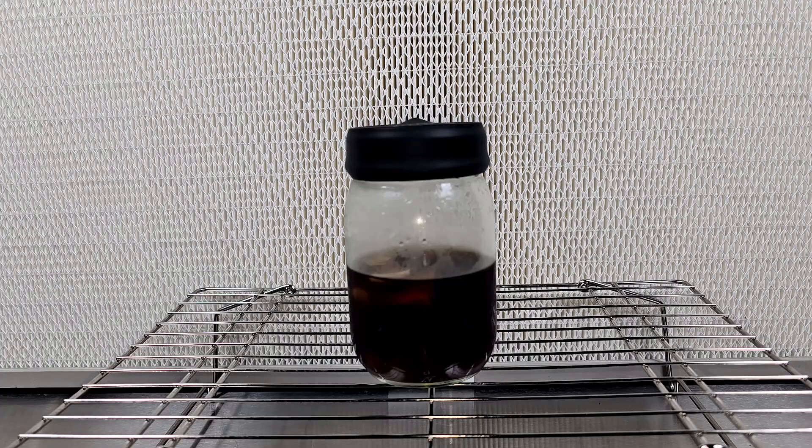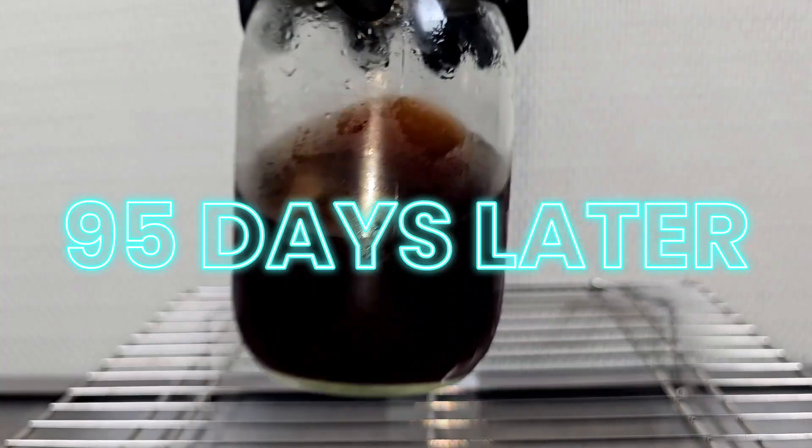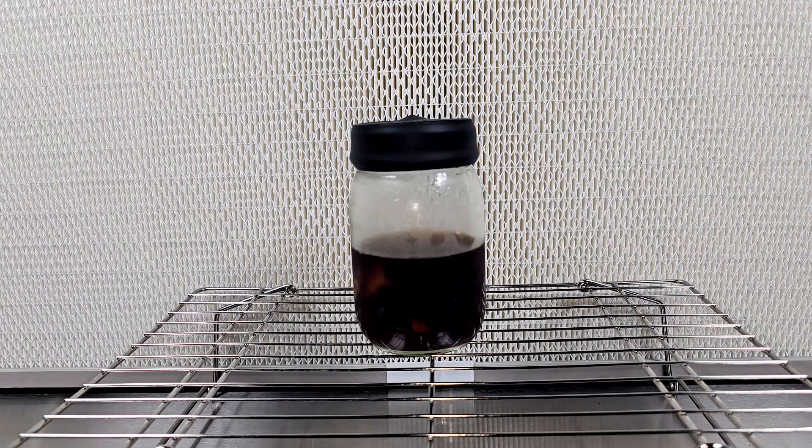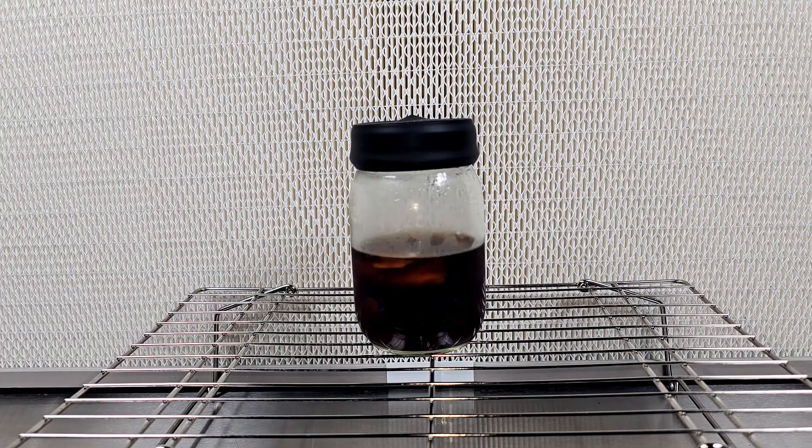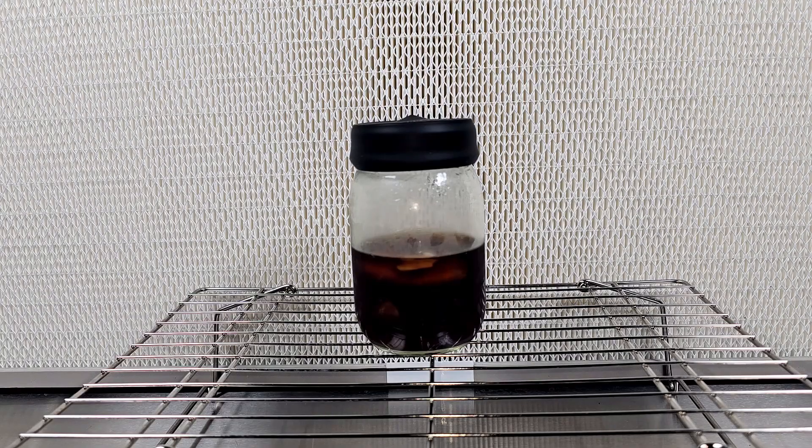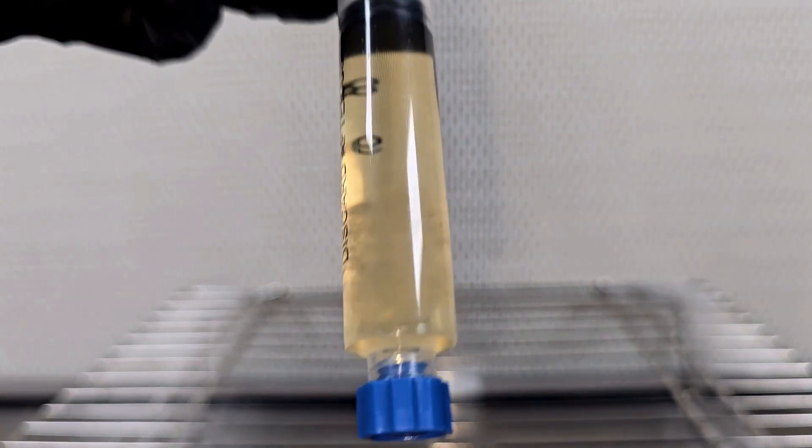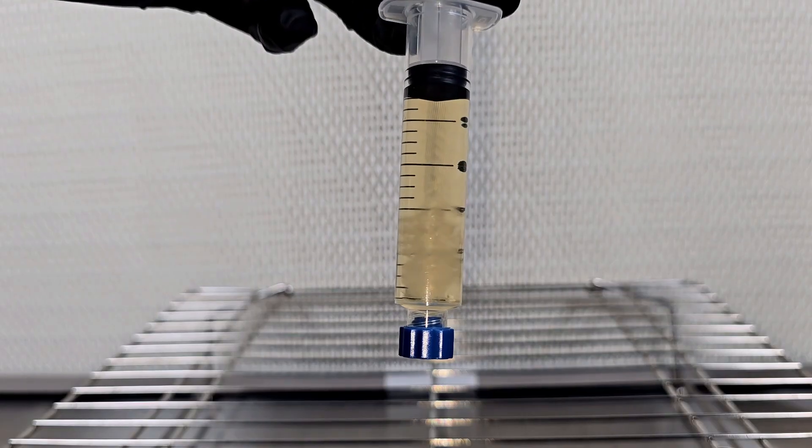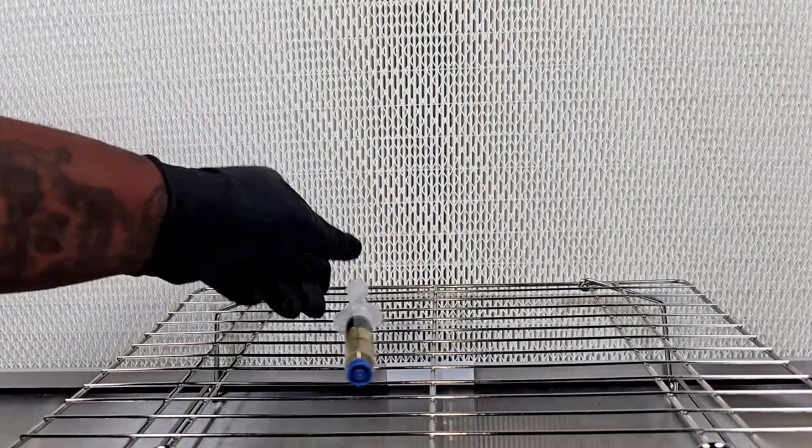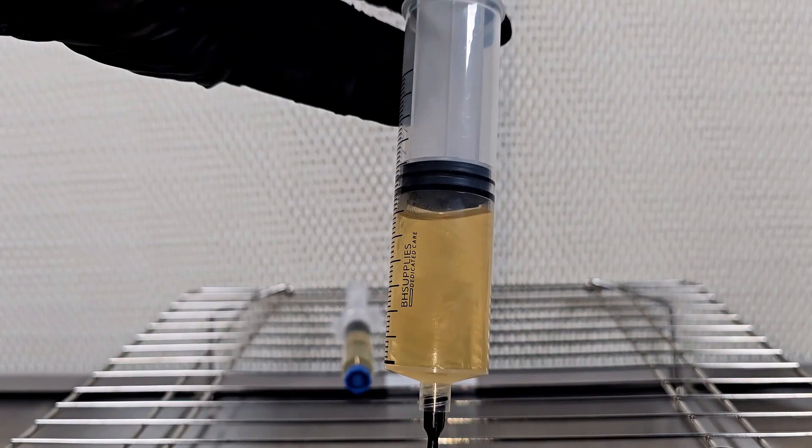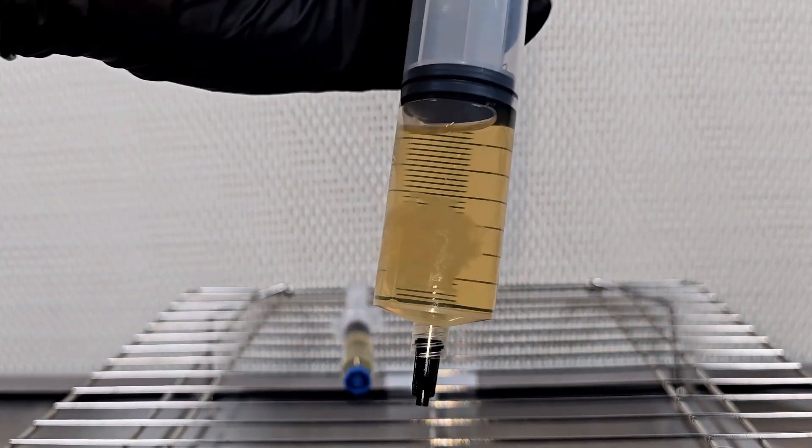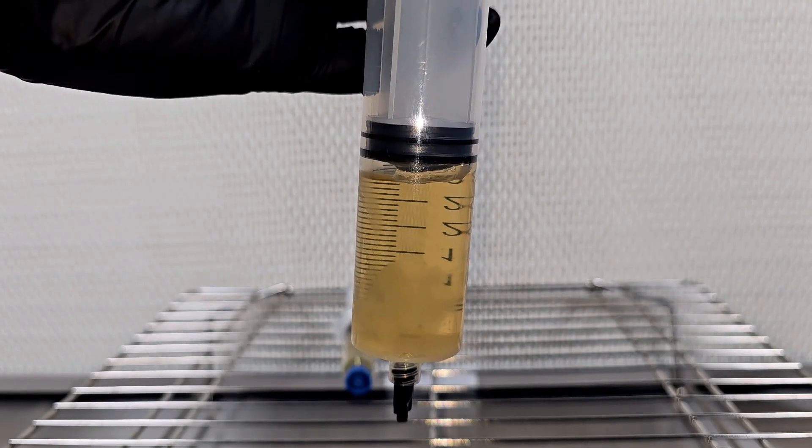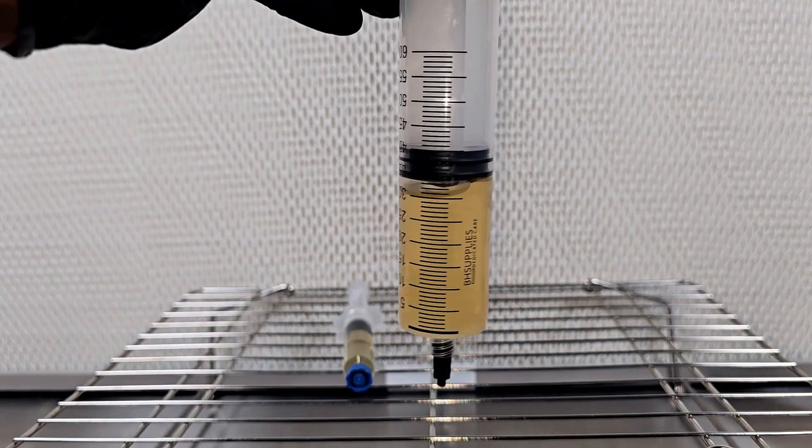So what you're looking at right now is the same jar that you just saw, but this is 90 days later, actually about 95 days later. You can see that this liquid culture is already dark and not usable anymore, just like the directions on the culture kit says. It can last for up to four months inside this jar. Mine lasted about three months, and that's all fine and dandy, but I want you guys to look at the liquid culture that I put in the syringe. If you look at it, you can see that it looks exactly the same as it did three months ago. So for all of you guys who didn't understand what I was saying whenever I told you in the live video that the liquid culture in the syringe is just fine, but the liquid culture inside of the jar is not usable anymore, this is what I meant. So what's the solution for the problem? The solution is whenever you guys make your liquid culture, go ahead and put it inside of all your syringes. Go ahead and fill up your syringes. If you do that, it'll last for a long time, just like all your other syringes from whatever vendor you decide to go to. It'll last just as long, which can be a very long time if you're using your refrigerator.